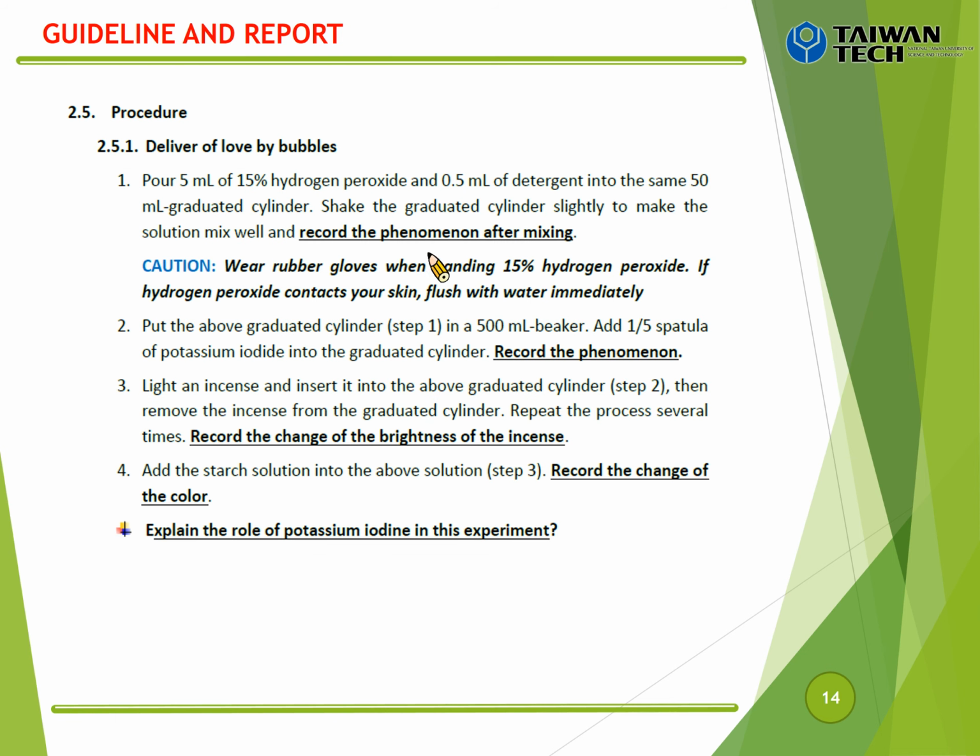And the next part, we have the procedure. In the procedure, I will show you step by step how to do the experiment, what you do, and you need to make it into a block diagram. You can use the block diagram and also this description to do the experiment. And you see from here, I have some caution or some notice. It means that is something you should check carefully for your experiment.